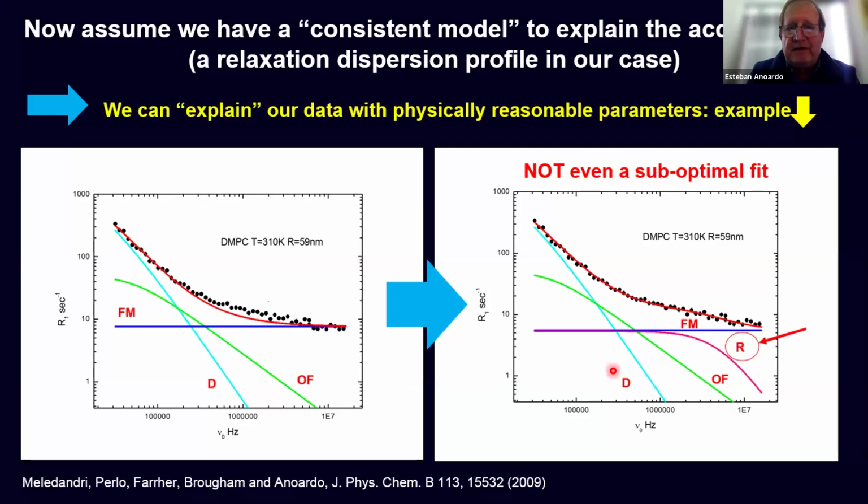It may happen that the sample we're measuring has never been studied before, and then we are forced, in principle, to measure or to get some information using other techniques. Why? Because in general, in this technique, which is model dependent, the functions which we are using to fit are moving in a multidimensional space. That is extremely complex if we want to get all the parameters without any external information. At least for the validation of the model, we need some inputs from other techniques.